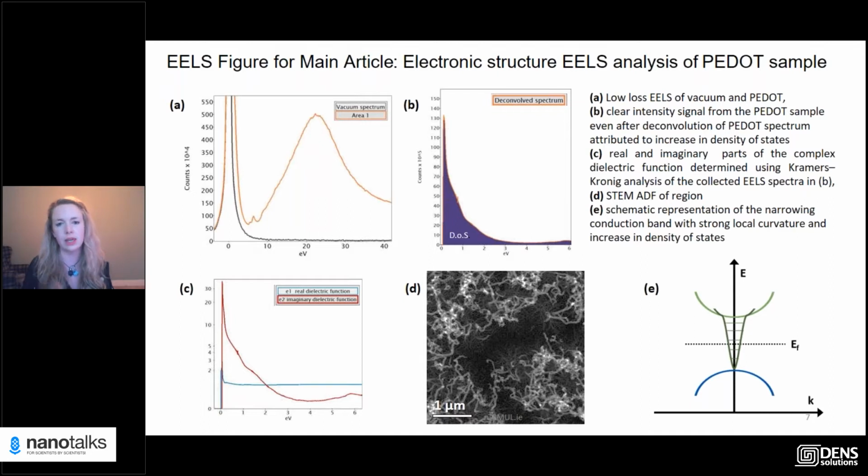KAUST and Professor Benoit at KAUST. And then we were able to show that there is this kind of increase in density of states right down at the zero loss peak. And also just to confirm that it's not just a once-off, we took several measurements and also repeated those measurements to show that there's not this degradation of the material. So it's not the beam inducing this, it truly is the material itself.